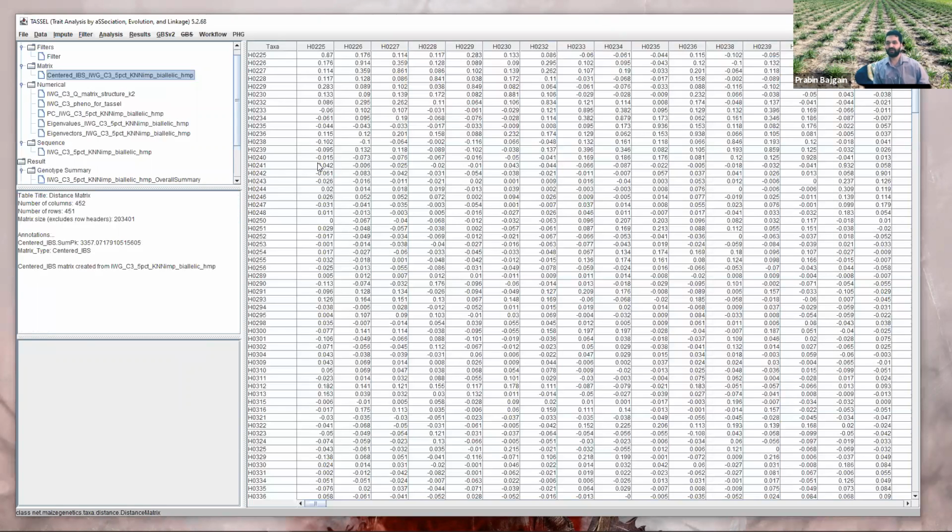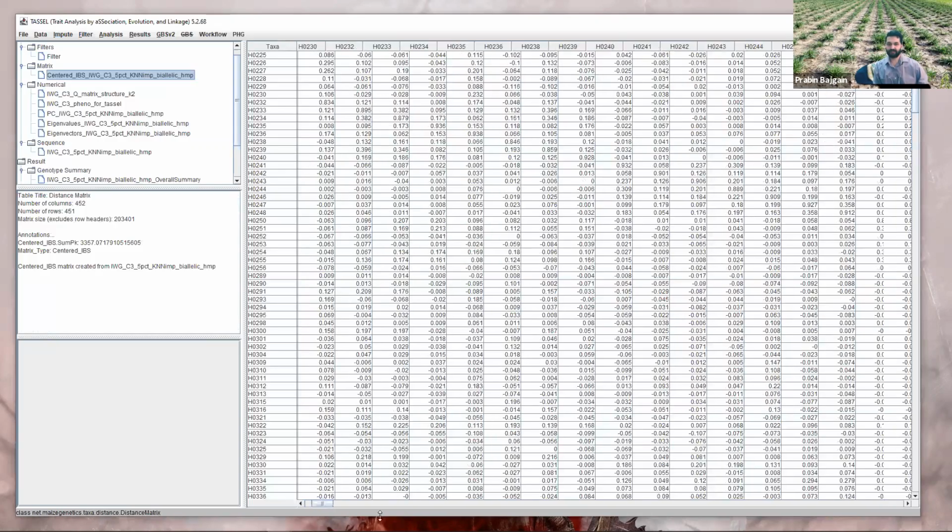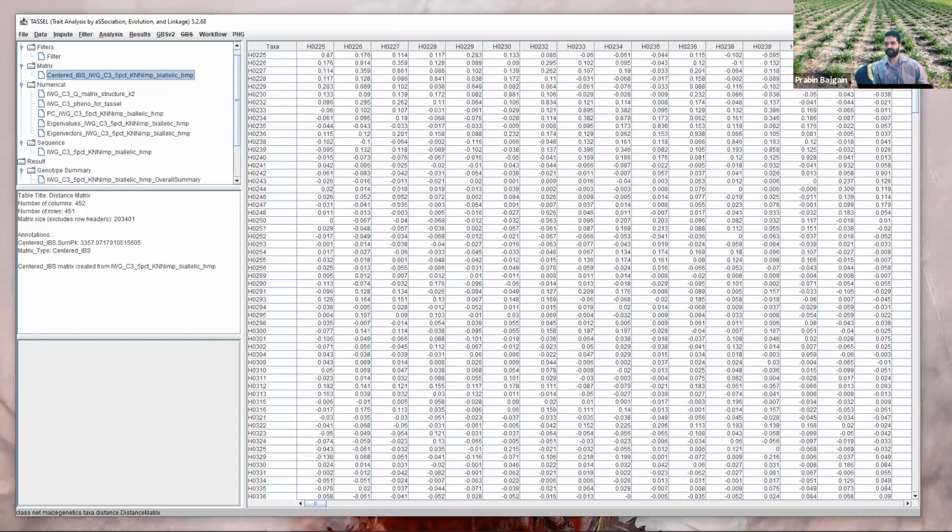It's very quick. And you see a square matrix of the upper and lower triangles, each line and the value with other lines. And I would say here that these numbers are relative. So for example, you might be wondering why it's not 0 to 1. I do not know the answer to that, but you can convert to 0 to 1 if you prefer to, as it does make filtering a bit easier later on in some of the other analysis you might do. But these numbers might be different in your population.